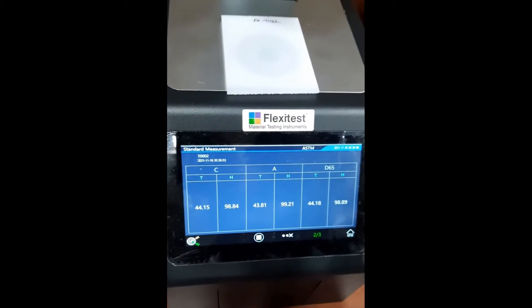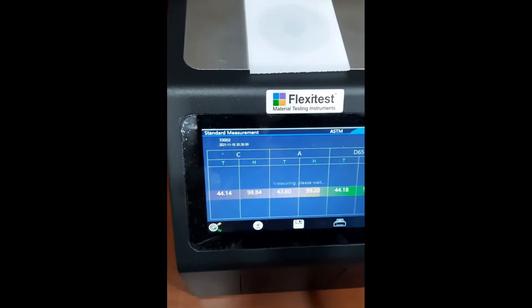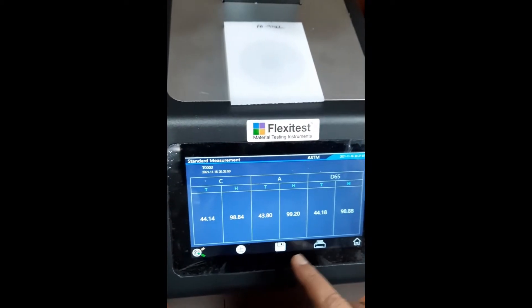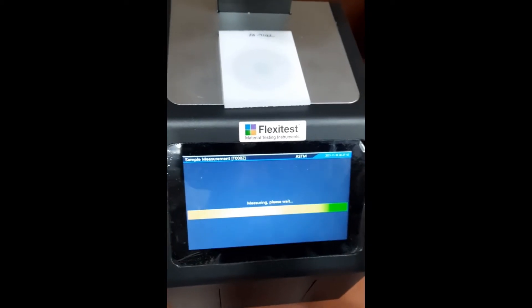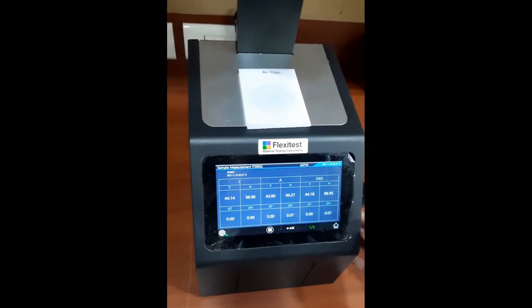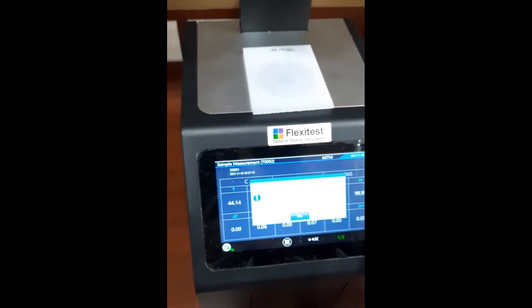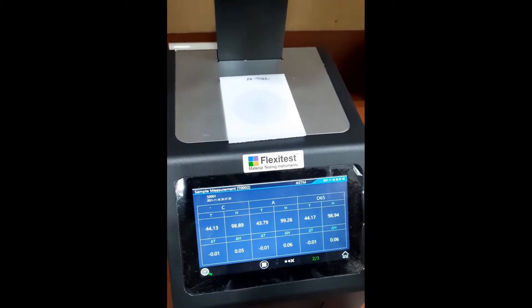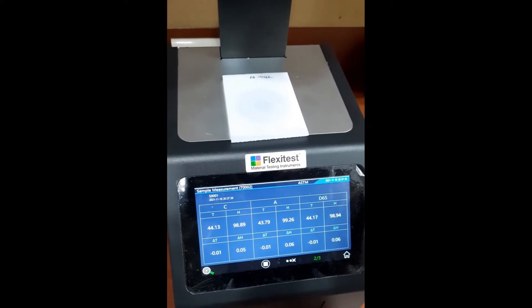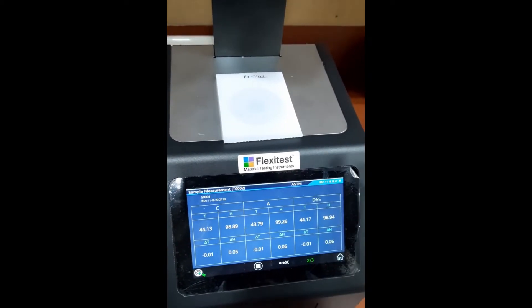This is 2 of 3. I have set for 3 average readings. So this is 3 of 3, and I will get the difference value. These are the differences. Again, this is 2 of 3, then 3 of 3, and this is an average result.